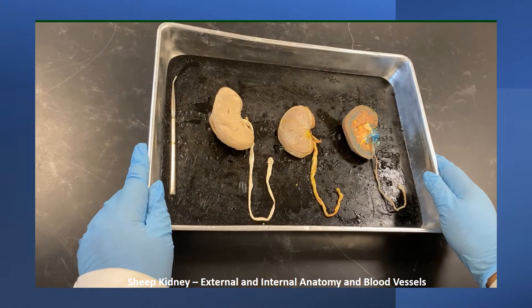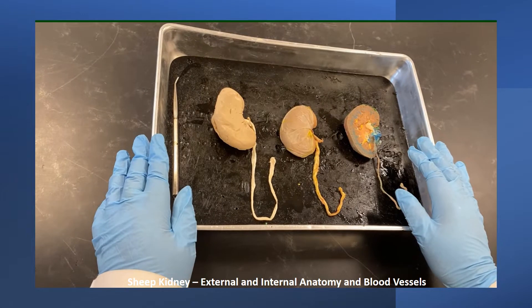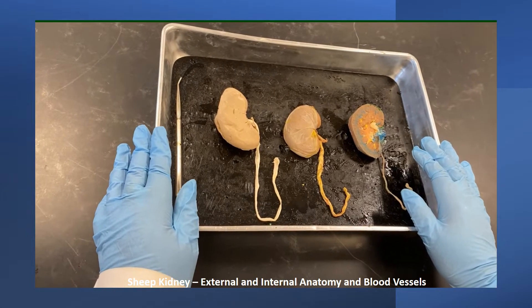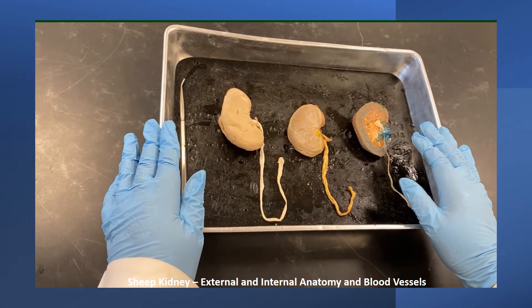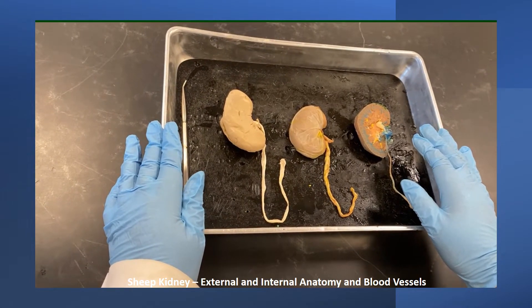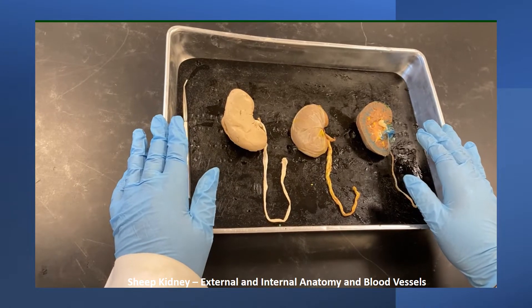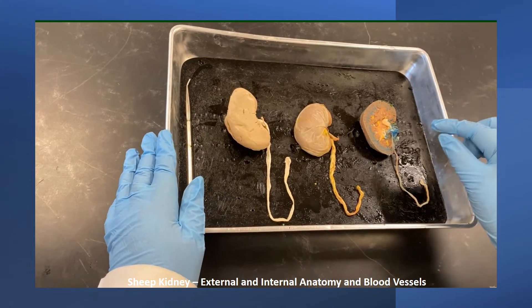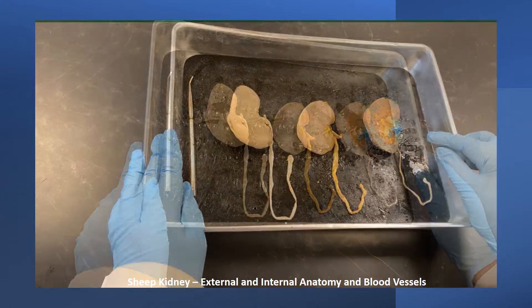We will look at sheep kidney today. We will start with the whole kidney, then we will look at internal structures and then the distribution of blood vessels.